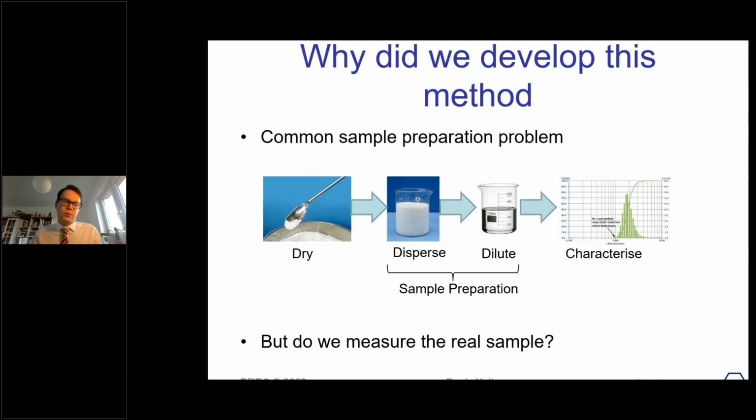And in fact, they don't act as nanomaterials whatsoever. So the regulators were asking this question. But when you give your solution to an analytical lab, they would put it in other machines such as DLS, particle tracking analysis, or others, and they would have to dilute that solution quite severely. So if you start with a paint or some sort of cosmetics formulation, you would actually have to dilute your sample severely. That in turn breaks down all these agglomerates and aggregates, and what you get is a real mixture of all sorts of particles, primary particles, constituent particles, agglomerates and aggregates, and that sort of misrepresented the actual picture. In reality, you had a completely different set of particles to what analytical labs would actually see.